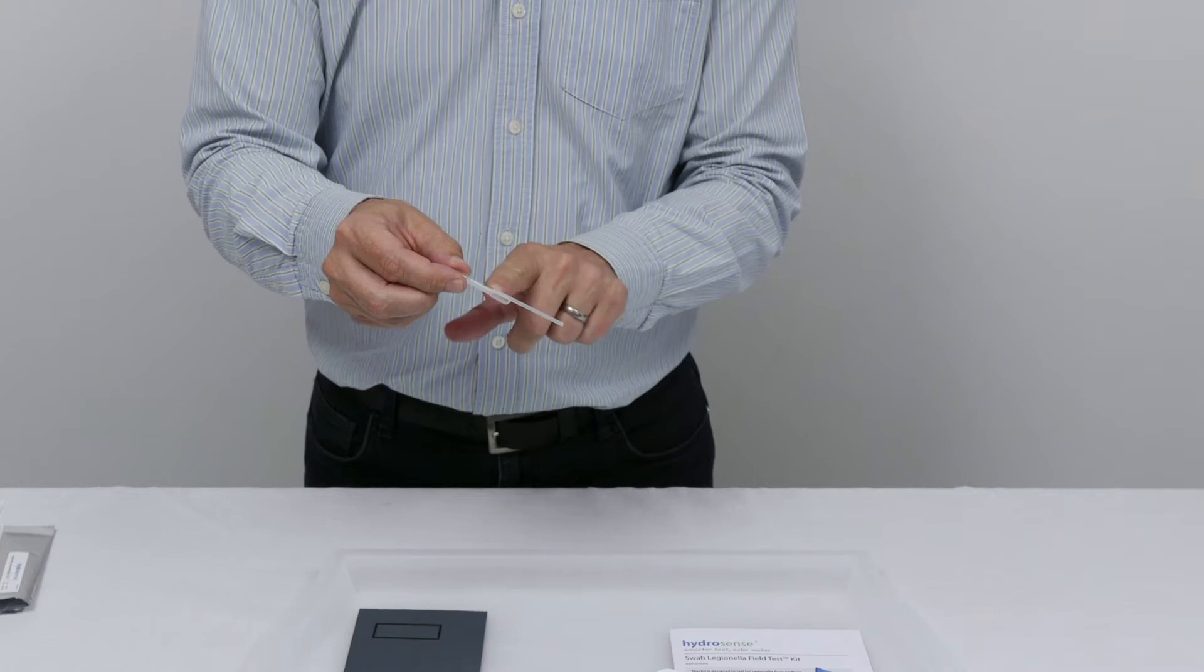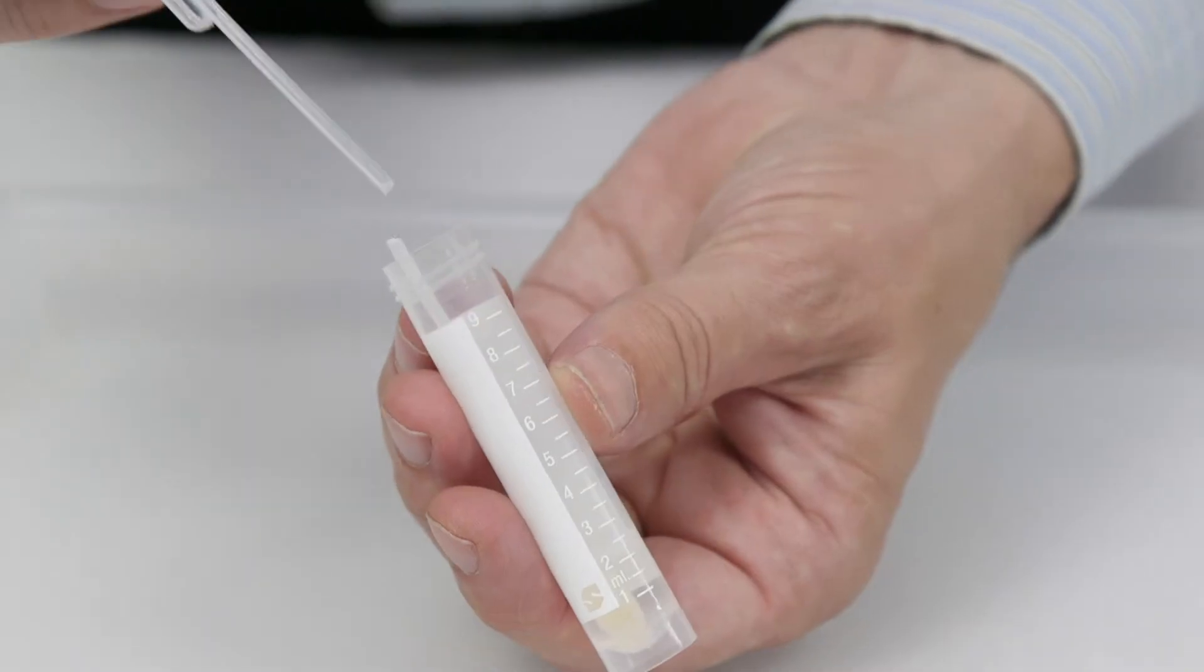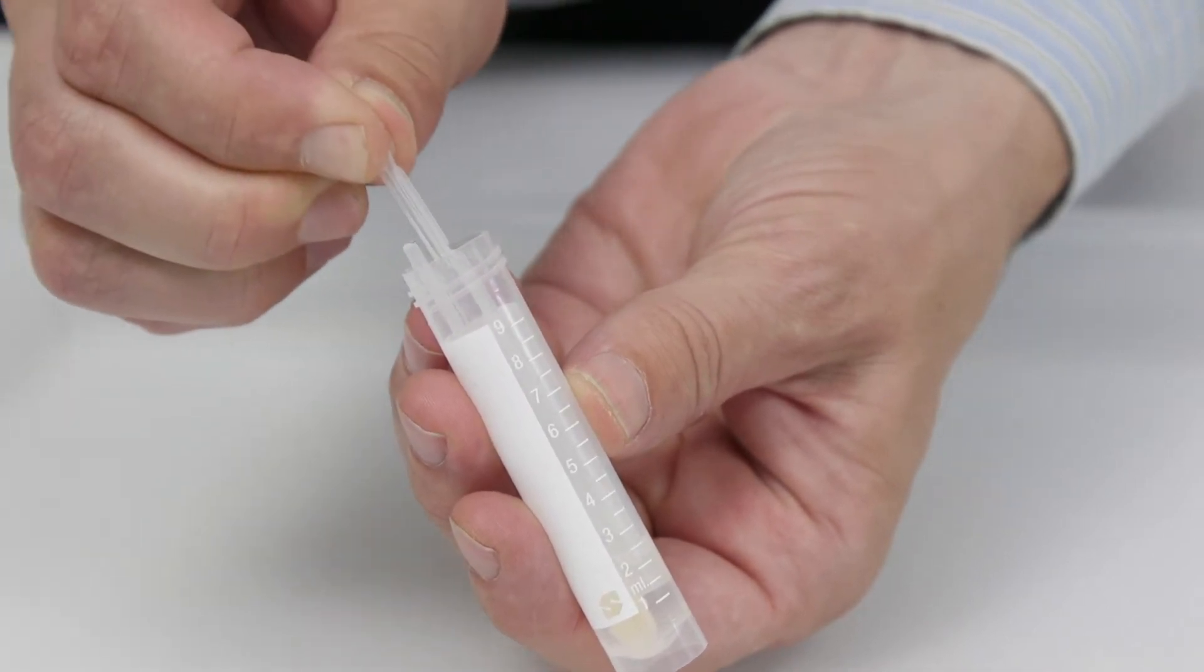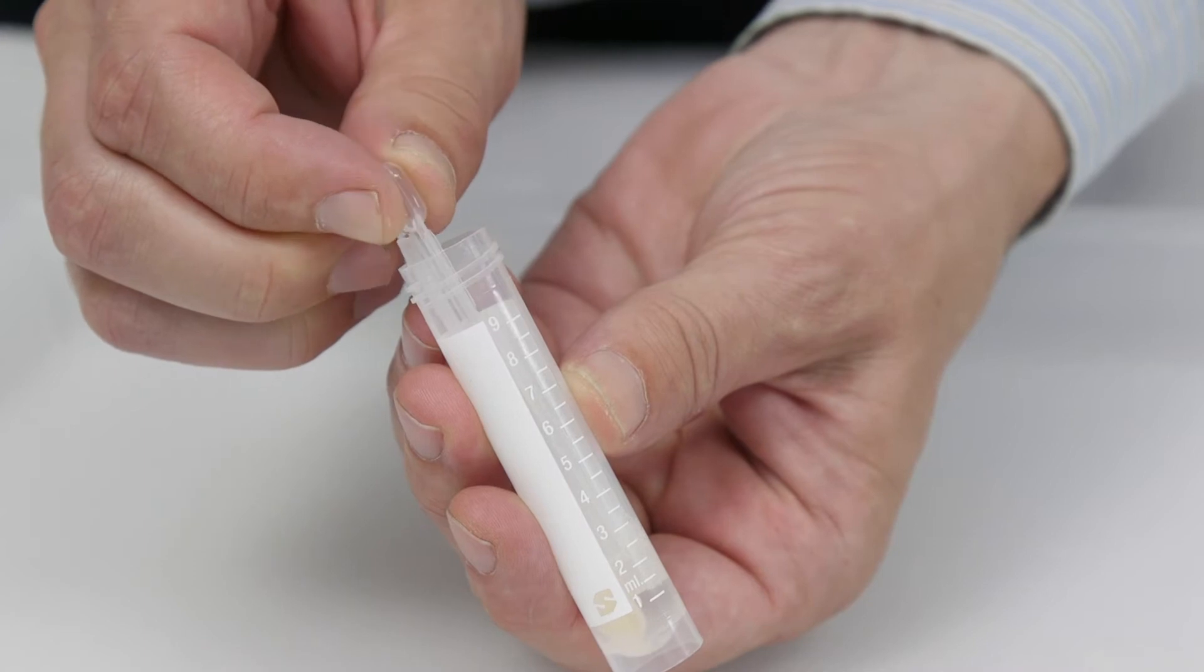When we are using the pipette, we only ever press the top bulb and not the bottom bulb. To take our sample from the vial, remove the lid, press the top bulb in, place the tip of the pipette into the solution, and then release the bulb, drawing up the liquid into the pipette.